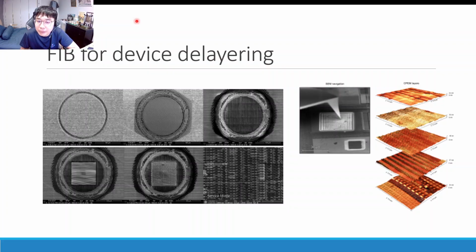And another purpose is also to do some form of investigation of, let's say, chips obtained from a certain company. It's quite common nowadays, especially with the very competitive semiconductor industry, for various companies' analyst teams to obtain the chips of certain well-known market leaders and do a certain tear down to analyze what kind of structures and architectures are being used in those chips. And basically the FIB can also be used for such purposes.